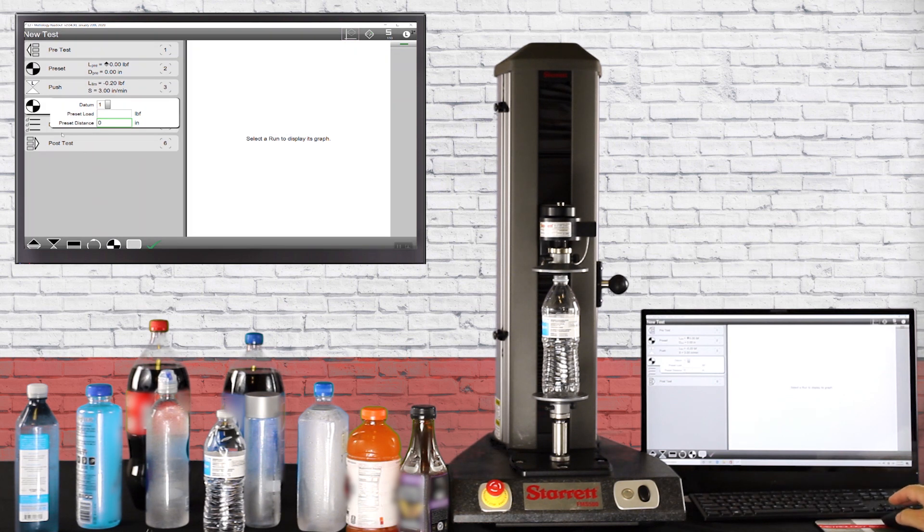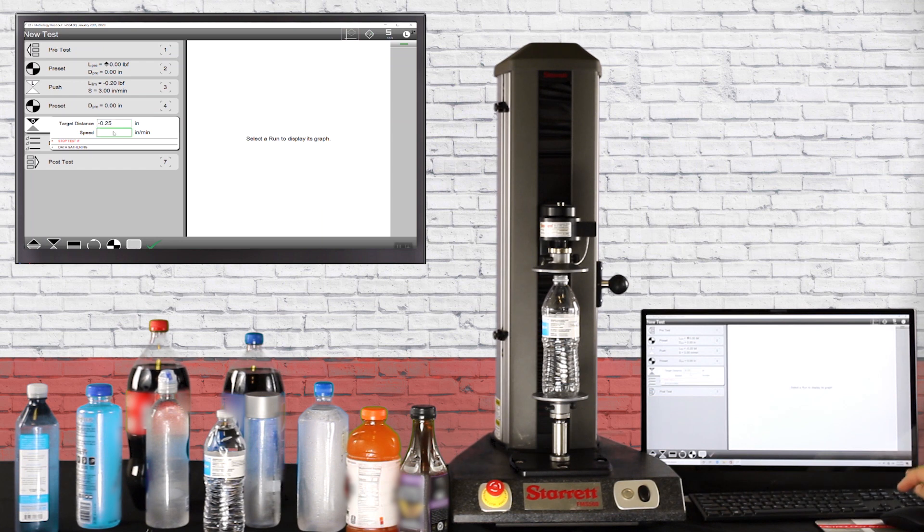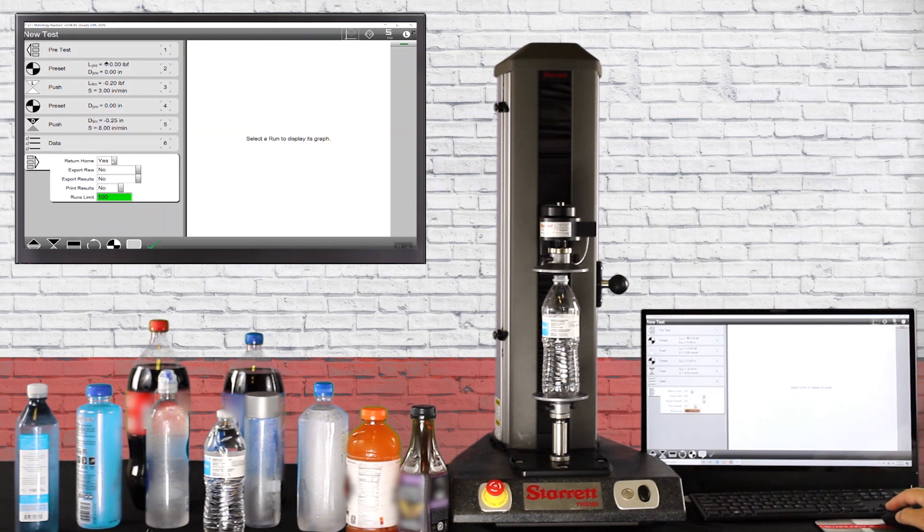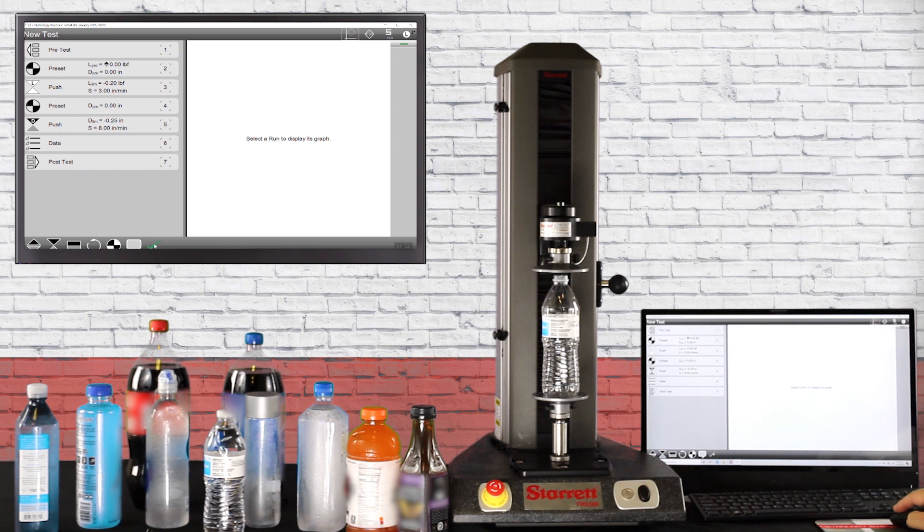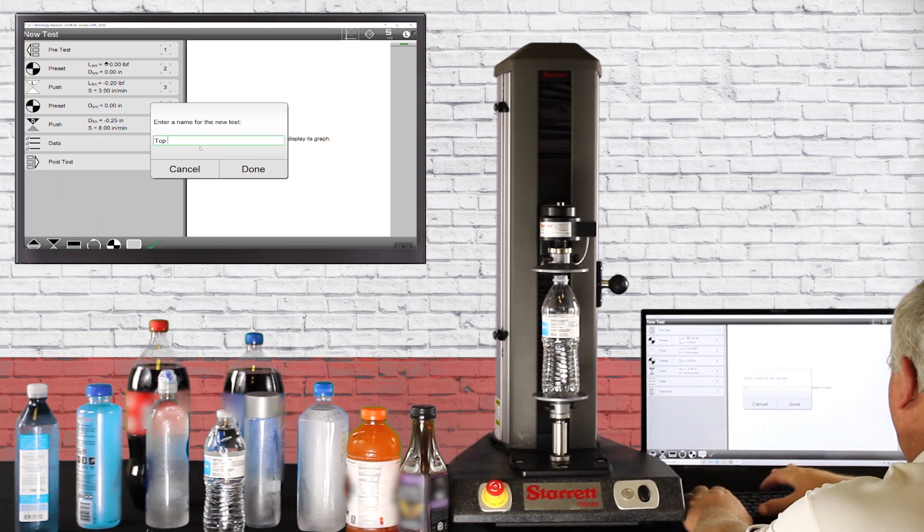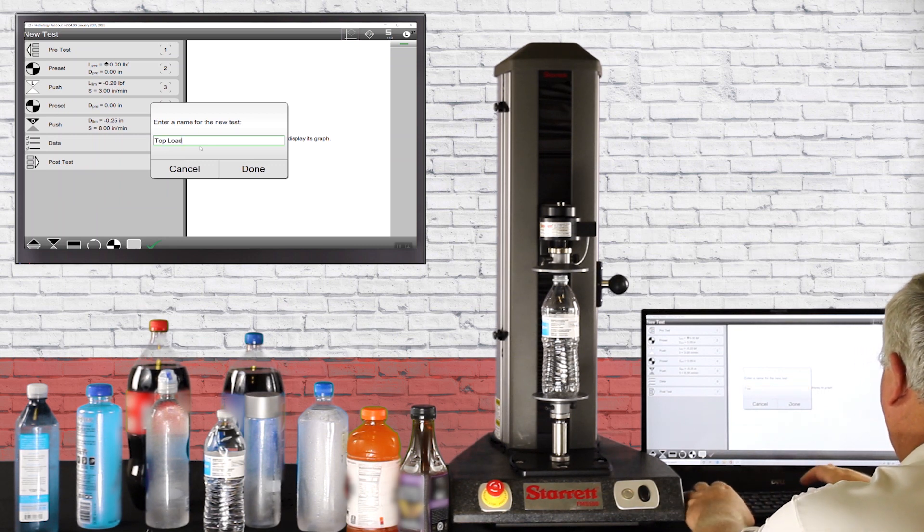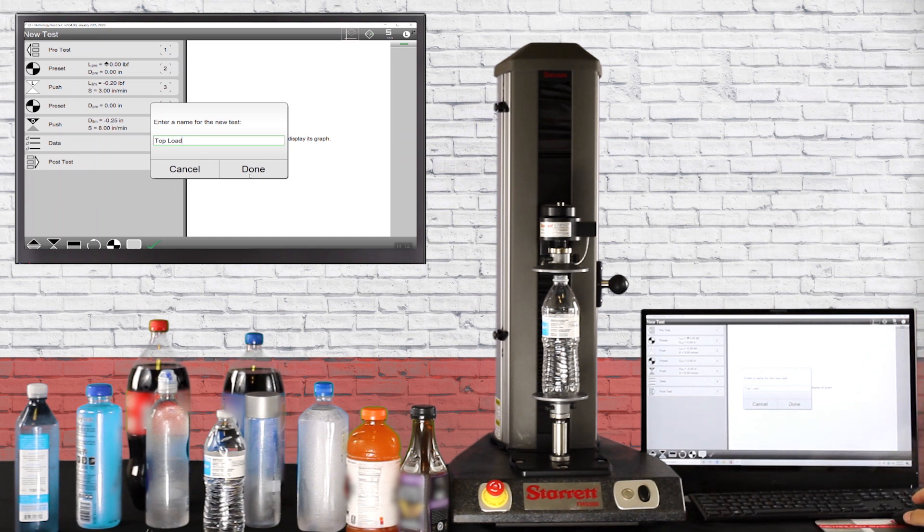The next step of the program, we're going to go to a distance. The target distance is going to be 0.25 of an inch at eight inches a minute. Next is the post test. We're going to have a return home and we're only going to put 25 runs on the screen. You hit the green check, hit the green check again, click save. Now you'll type in top load. Back out of the screen, hit done.